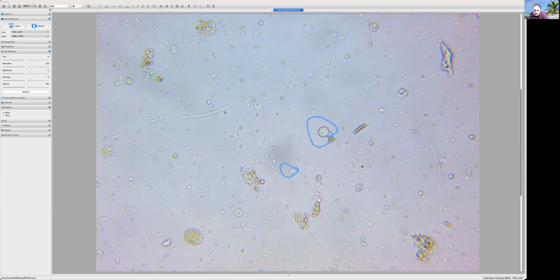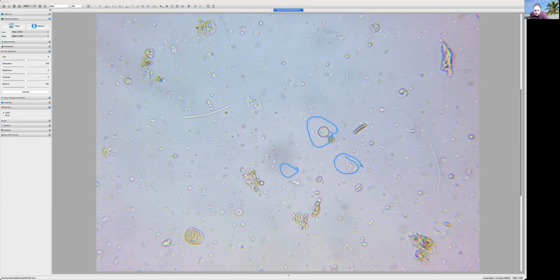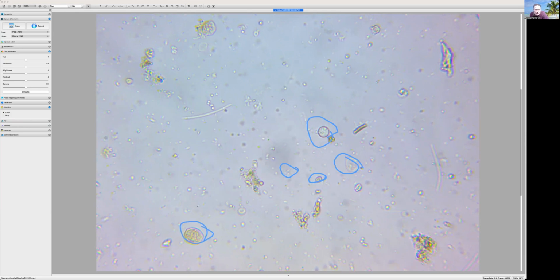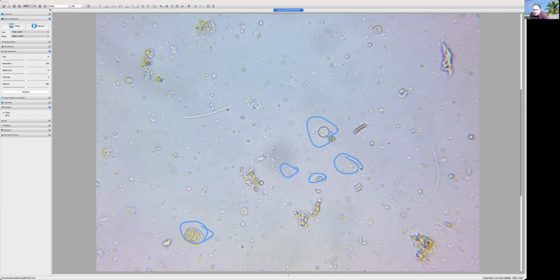Here's flagellate. Here, testate amoeba. Don't move around, flagellate. This, oh, I'd have to zoom in on it some more. It looks possibly like a testate amoeba. Very small. Testate amoeba. This is looking like something. Cyst of some sort. Okay, so that all looks good.